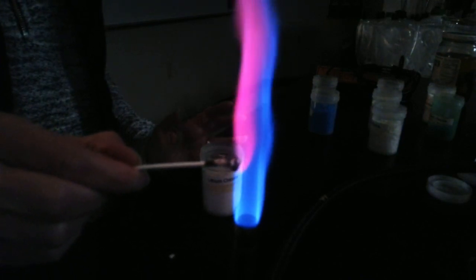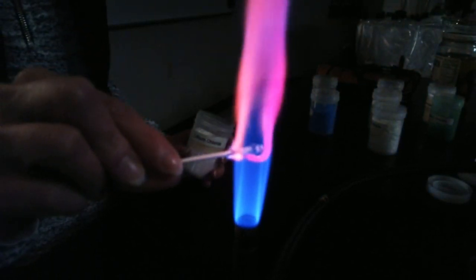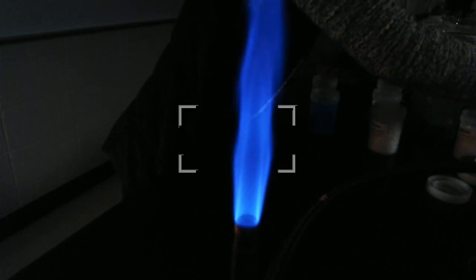And it would be a low energy color in the electromagnetic spectrum. The reds and the oranges are the low energy colors. And so I could assume that the electrons in this lithium compound are making smaller jumps. They're gaining small amounts of energy, and then they're falling back down, releasing small amounts of energy. So that one's lithium. In the same way, let's test a couple other ones.